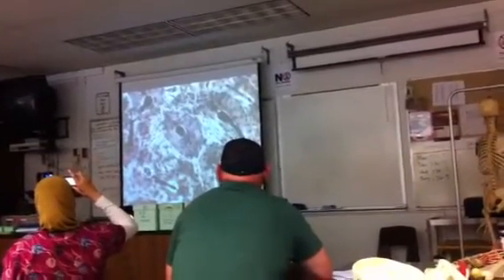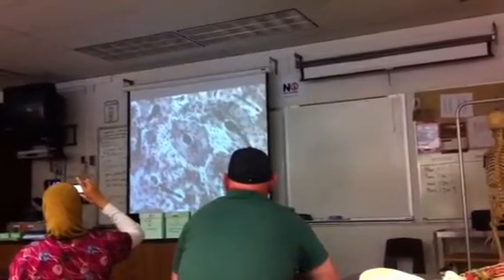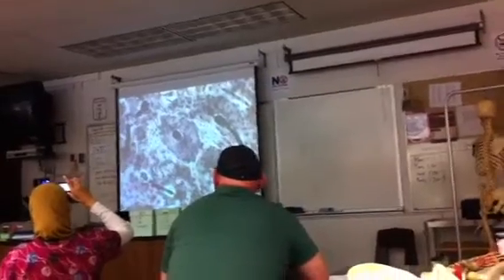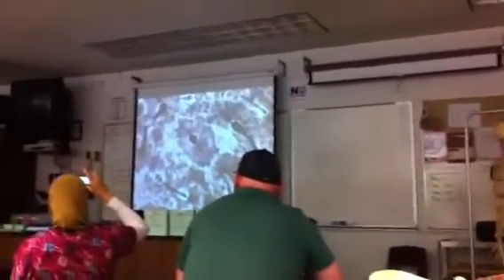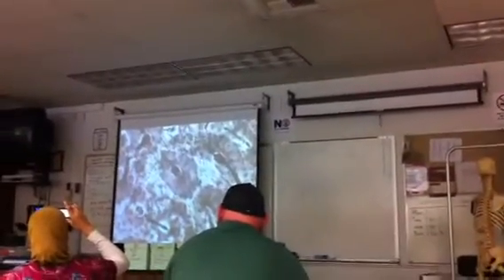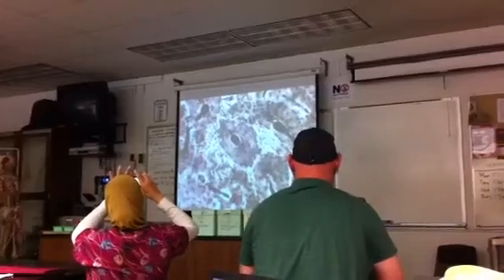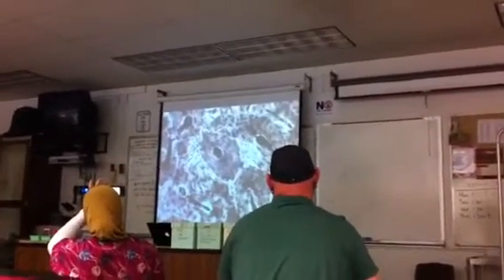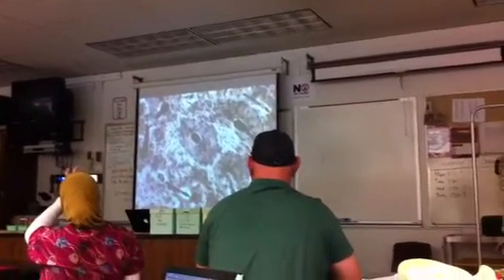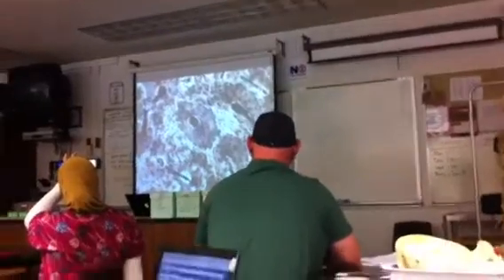So you can see the central canal. This round thing is an osteon. The little black dots arranged in a concentric, circular manner, those are the osteocytes, and they're arranged in this concentric pattern. So in the osteon, the way in which they're arranged roughly in layers, those are the concentric lamellae.